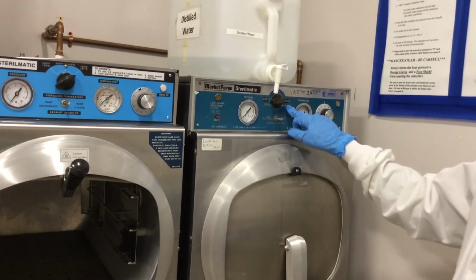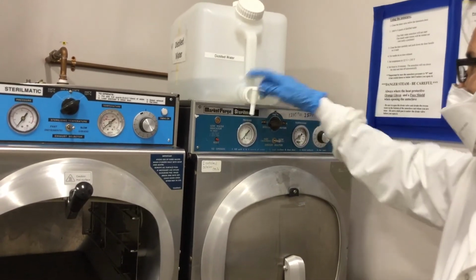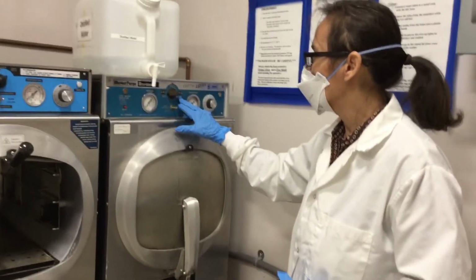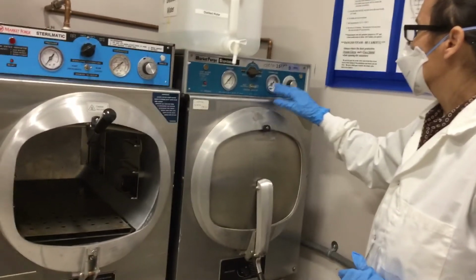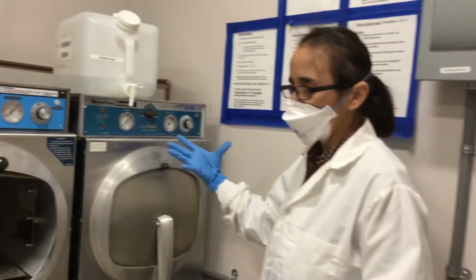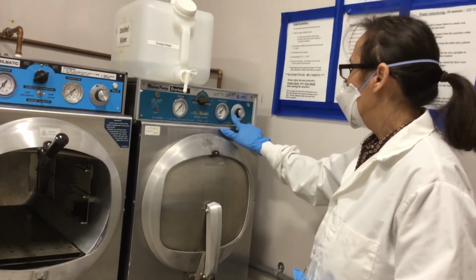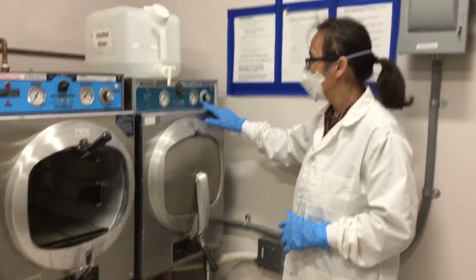And here we have the temperature for different types of materials. We use 250 Fahrenheit, which is the equivalent to 121 Celsius. And here is the temperature dial. So this will move into 121, which is already set for us. And then this is the timer. With this, you just turn the knob to whatever time you want to sterilize. So we will use 15 minutes.